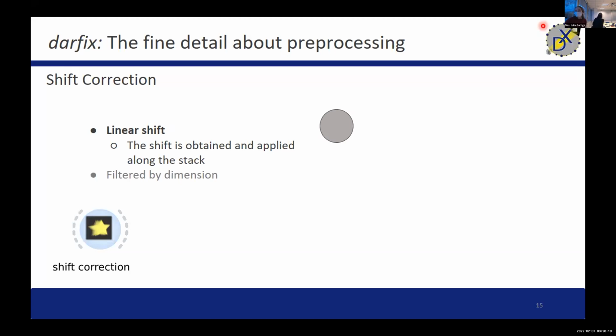Yes. Sorry, just one more question. What I noticed is, if I use the data from disk option because I don't have enough memory, I sometimes get an error message in the end part. I think I sent it to you once, something like "can't compute the 0 array". Do you know if this is an error on my side, or if I just use it now on my RAM? It works, but I just noticed.